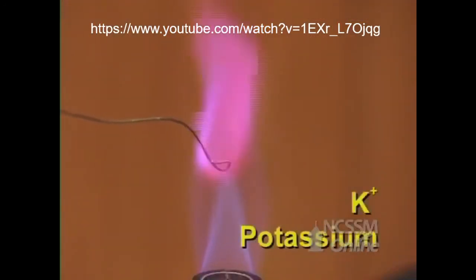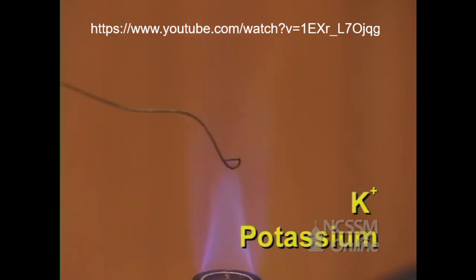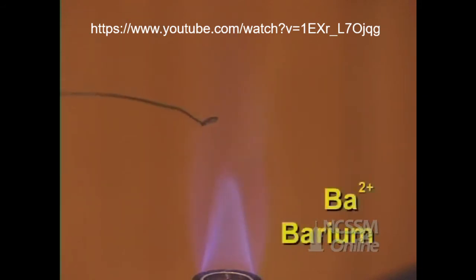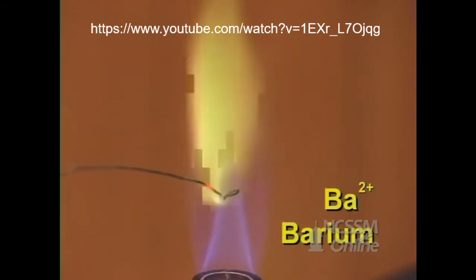Potassium. It should be a lavender color. This is barium. It's a green.